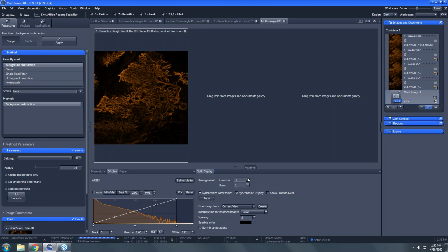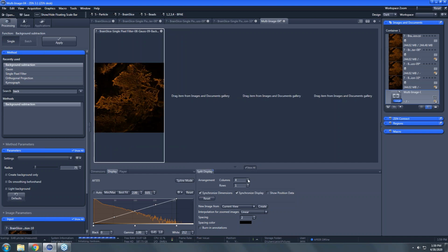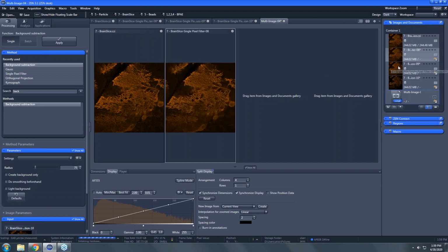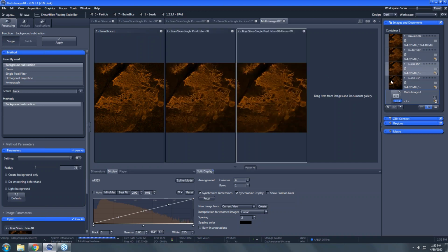Let me just fight the lag here, my nemesis. Okay. All right, so we've got 4 panels. If we drag in the images from the right-hand side, I think the original data is probably at the top of that list. You can put it in whatever order you want, but if you don't want my brain to explode, you'll go left to right in terms of our progress. Yeah. Great.